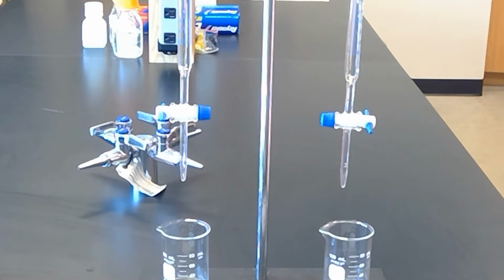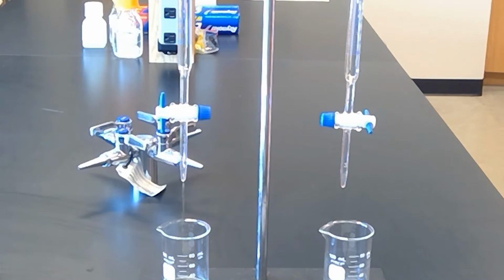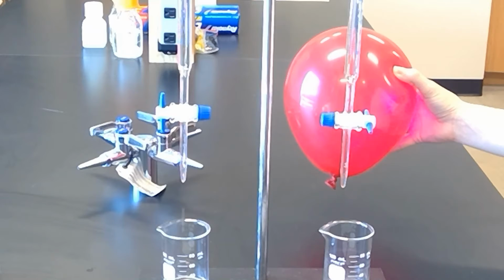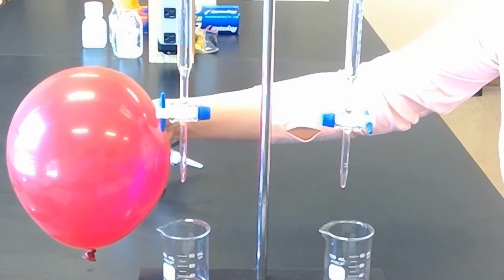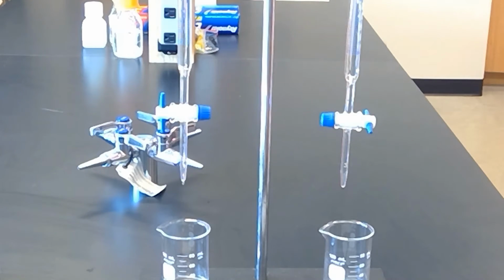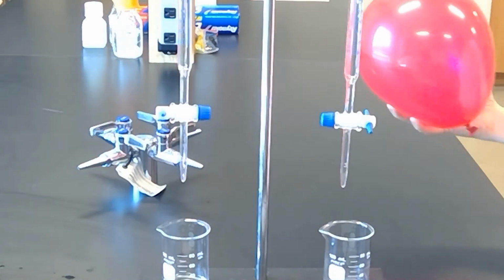Next, we have the isopropyl alcohol, which is part of our hydroxyl group and has a medicinal smell to it. Let that start to run. Charge the balloon. Of course, now we're going to have burette problems. Still works though. So even though the stream isn't the greatest, you can still see that it gets attracted. Do this one more time. Very attracted. Turn that off.